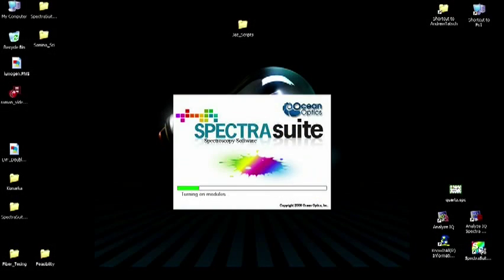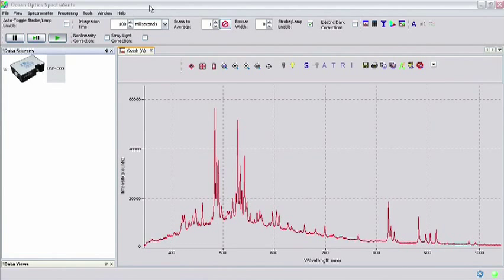Once your software is up to date, you'll need to determine the appropriate integration time for your application. The system will use this integration time to adjust the flash rate of the light source, depending on the mode you've selected. The PX2 can operate at repetition rates ranging from 1 to 220 Hz. For single mode operation, you can modify the flash rate by changing the integration time using SpectraSuite. The minimum integration time is 5 milliseconds. Use the integration time control at the top of SpectraSuite to select the integration time.